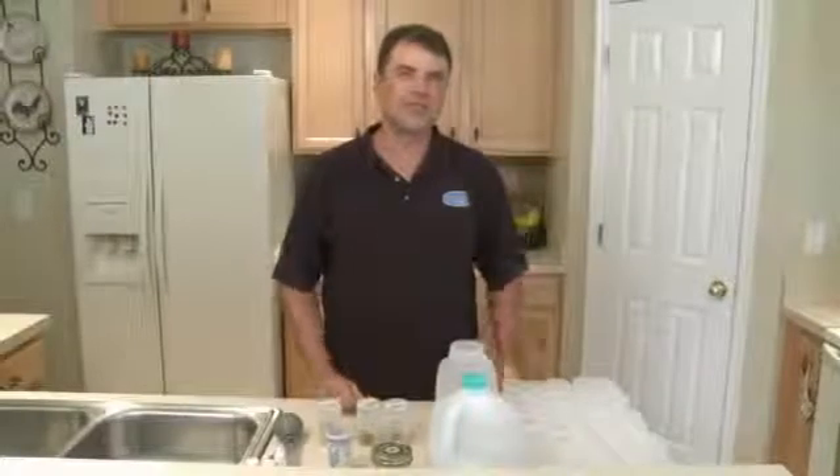Hello, my name is Bill Graham. I am the maker of the microclone and superstars plant tissue culture kits.